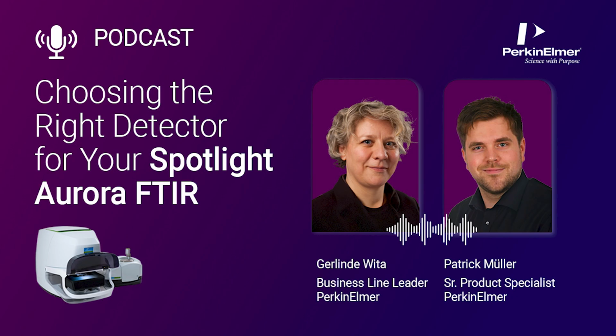Thanks a lot, Patrick. And can you please explain which factors influence the choice of the detector? Yeah, of course. So the first thing you always have to think about is what samples you want to measure, because this directly relates to the choice of detector. And there's two main factors. One is the size of the samples, and the other is the spectral range that is required for your sample measurements. And both of these influence the detector choice.